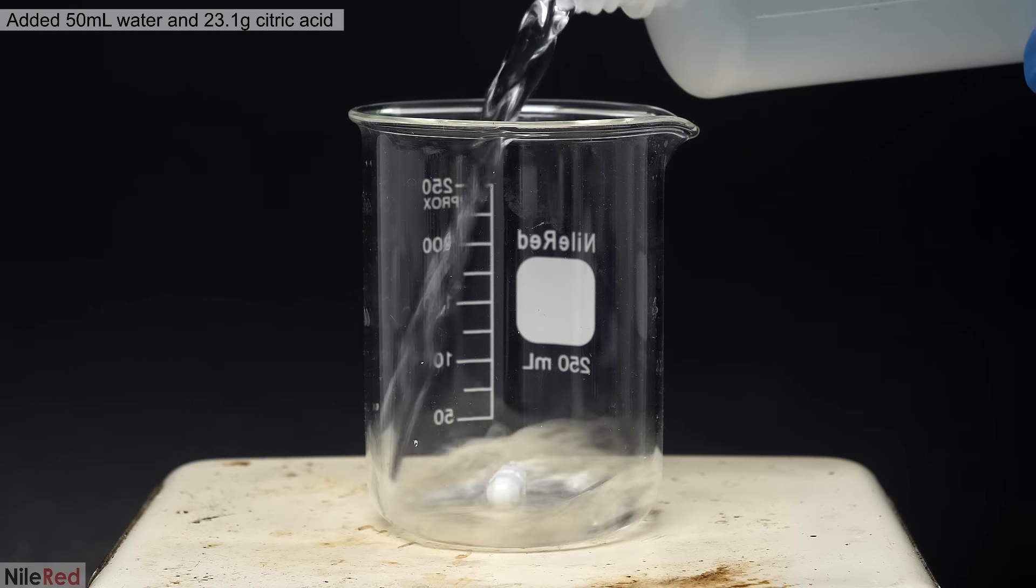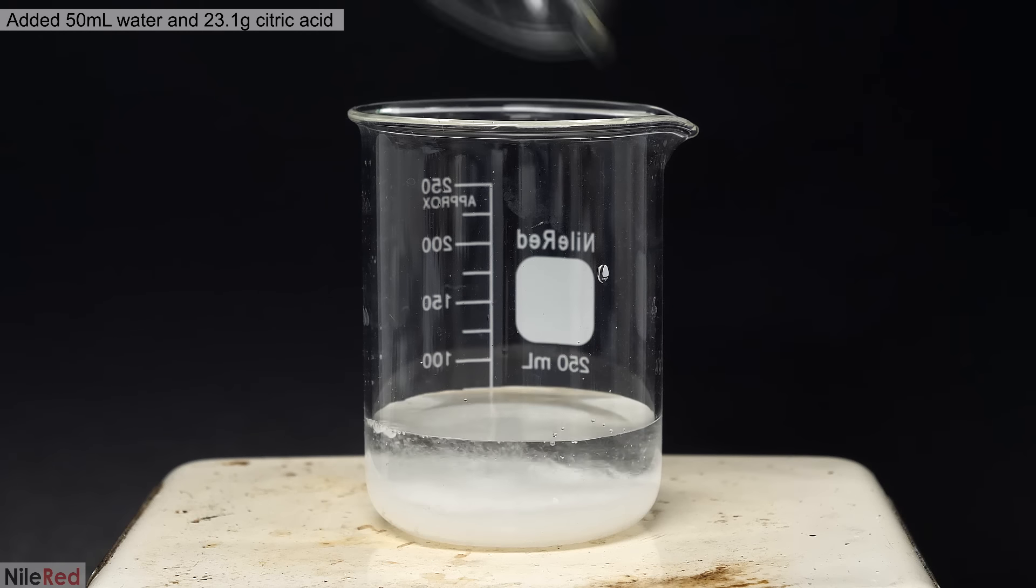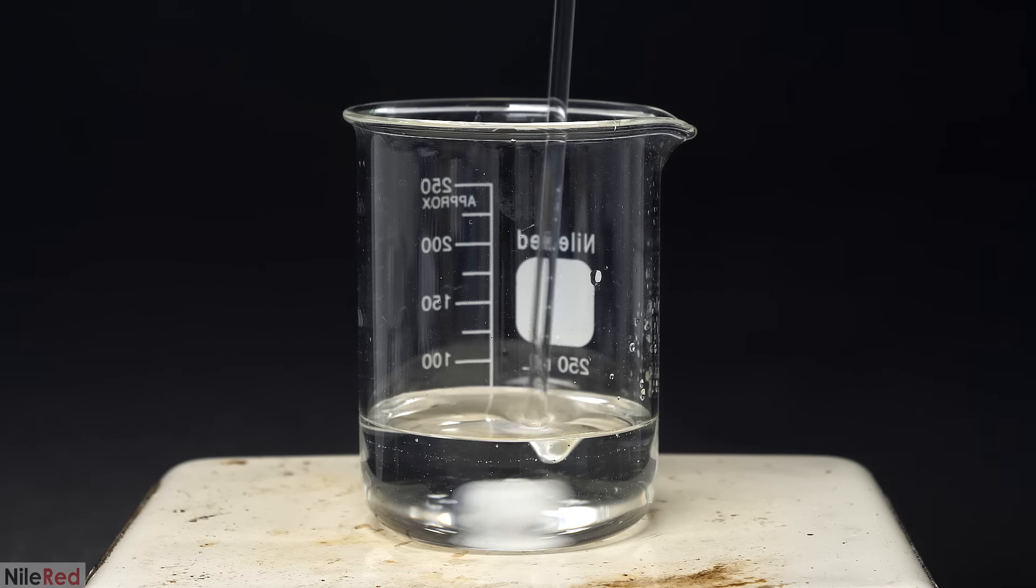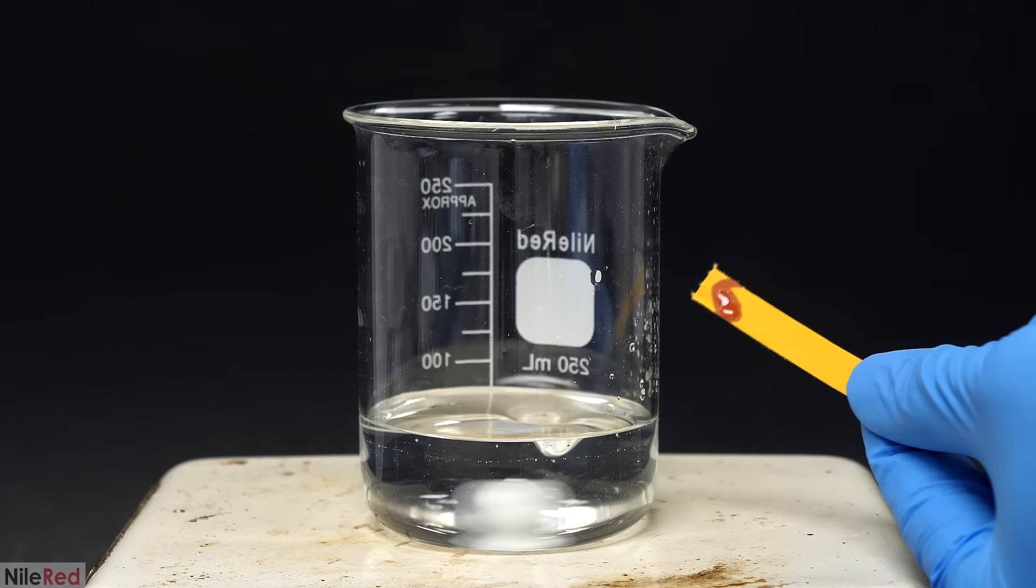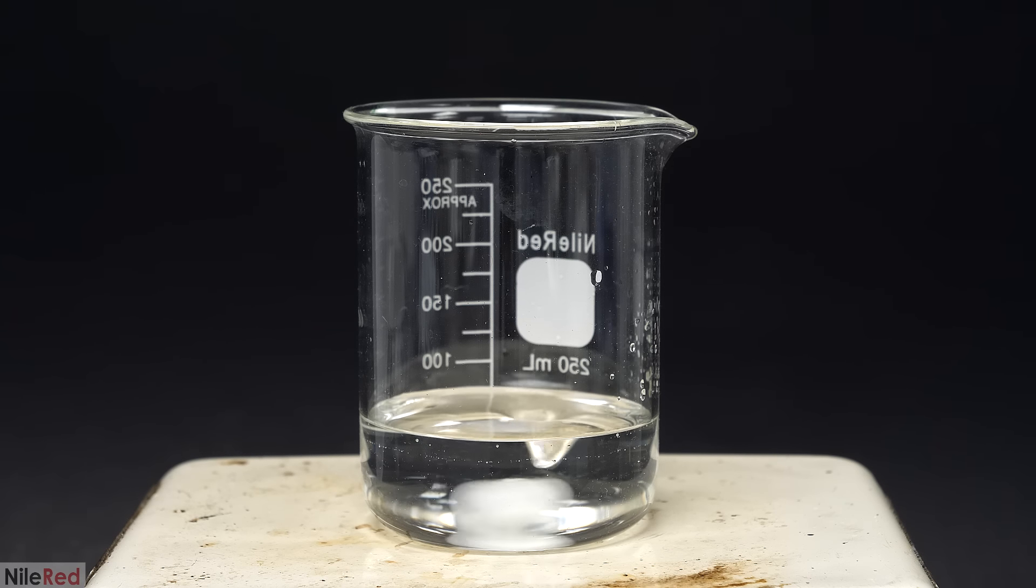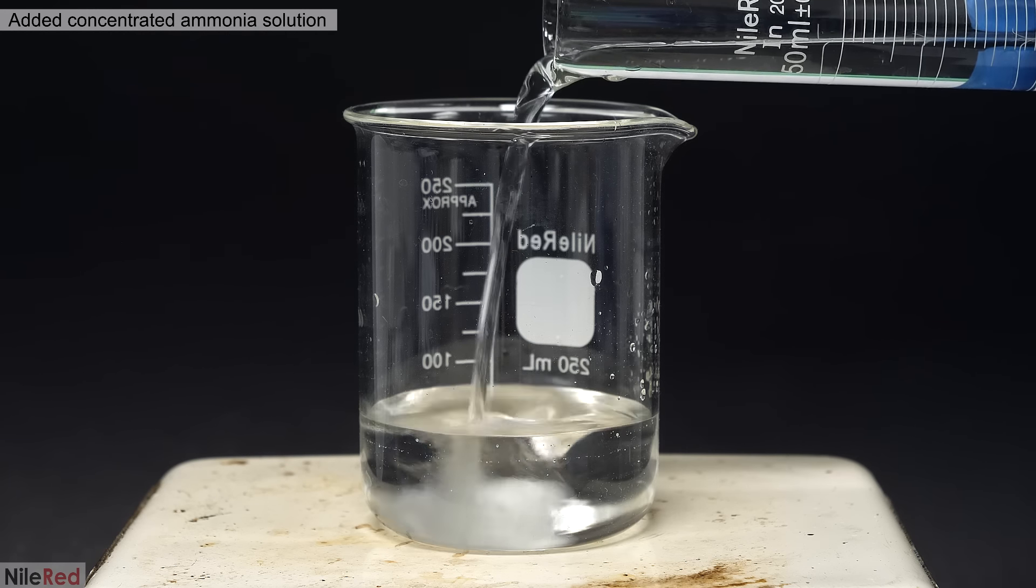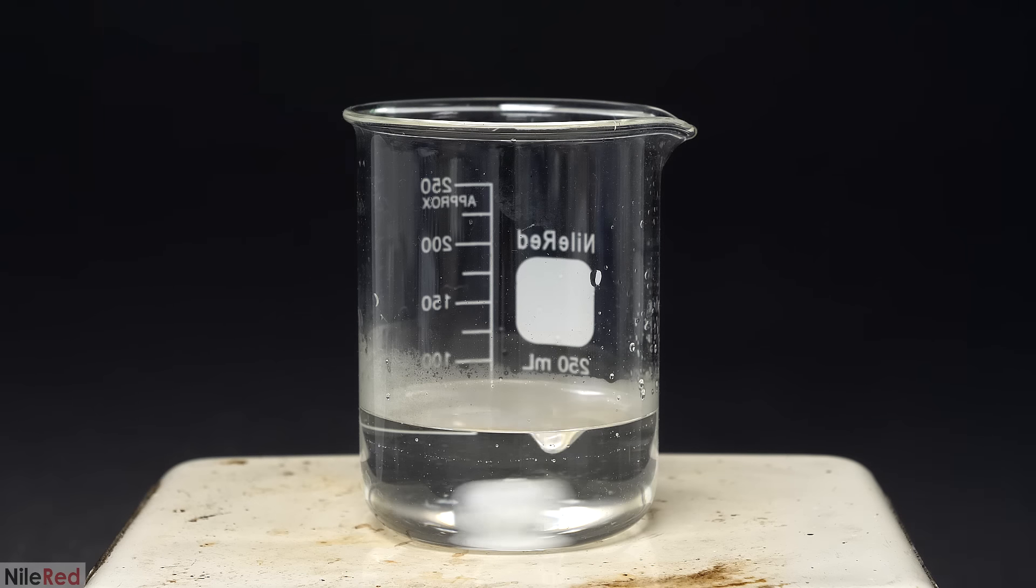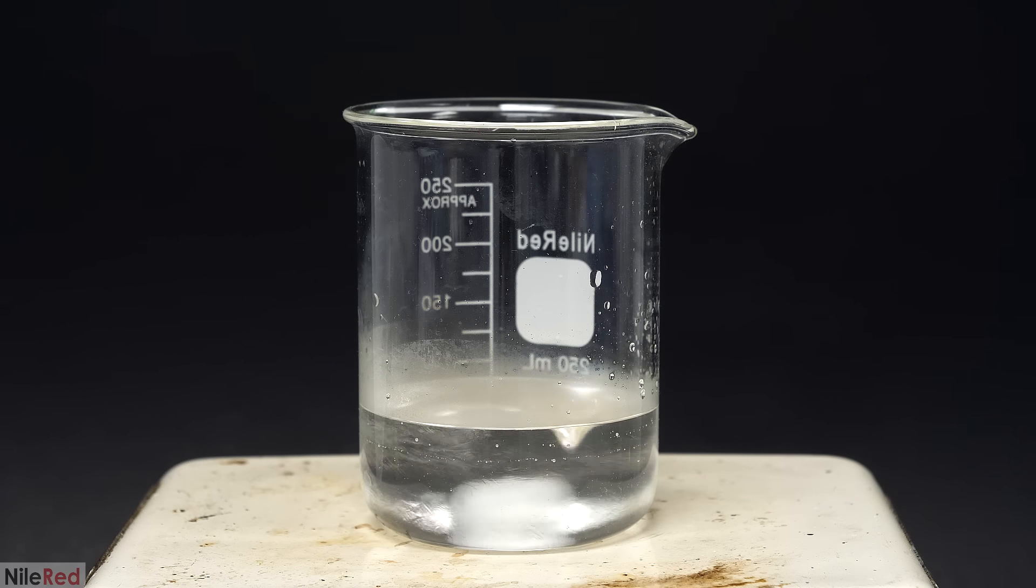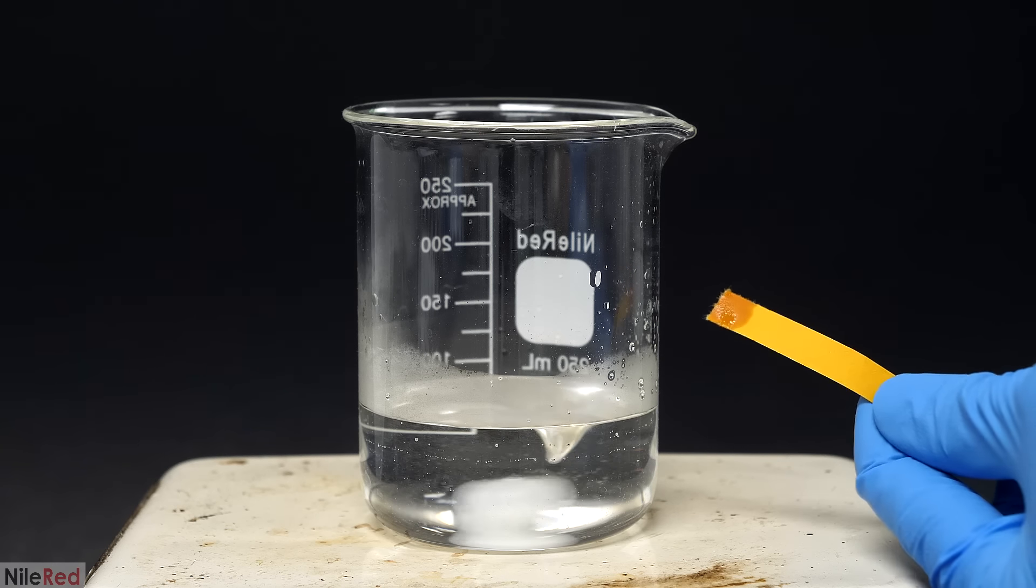I then moved on to making another solution. So to a beaker, I added 50 mils of water and 23.1 grams of citric acid. I turned on the stirring and when it all dissolved I tested the pH. The red color told me that it was highly acidic. The next step was to neutralize the citric acid by adding just enough concentrated ammonia solution. I wasn't exactly sure how much I needed because the concentration of my ammonia wasn't very exact, so I just had to add it in small portions and regularly check the pH.